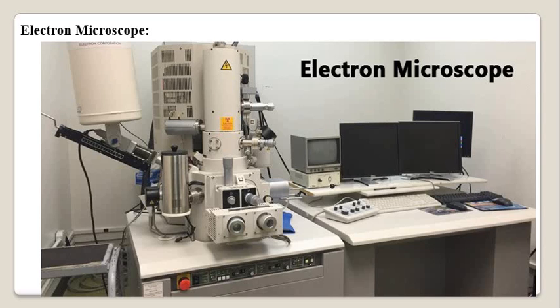Now, in the electron microscope, what would be the magnification? The question comes to everybody's mind. As we said earlier, it comes with a great magnification, but what is it? The objective and projector coils help in magnifying the image formed in the electron microscope. For getting the maximum magnification, an intermediate coil is fitted between the objective and the projector coil, and this coil further increases the magnification obtained with the two coils.